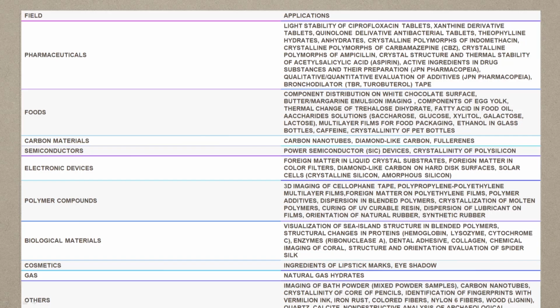Further, when you couple them with AFM, you get an overall picture about how they are distributed on the surface, how they change their electrical properties, as we will come to in the next class, and how their oxidation reduction potential alters, and all such information. Having said this, in this 19th lecture, we will talk a little bit about the applications of Raman spectroscopy, because this is one of the very powerful tools in modern analytical chemistry.